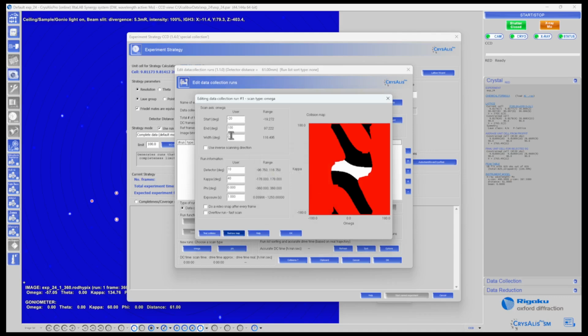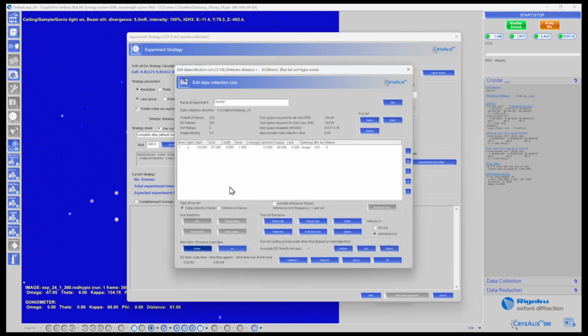The range at these settings is minus 19. So let's do minus 19. Test collision again. And angle is out of range as well. So 97. And at these angles, there is no collision for this particular scan. Alright. So we have this one scan.